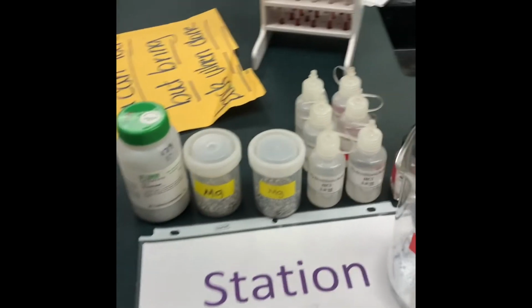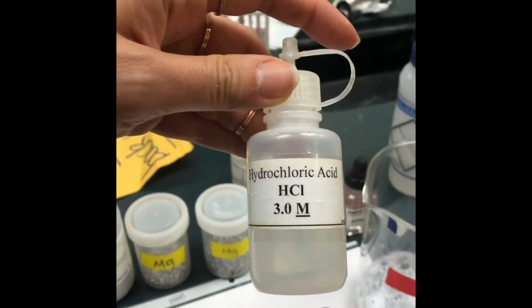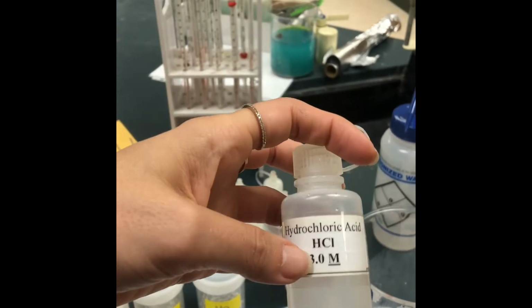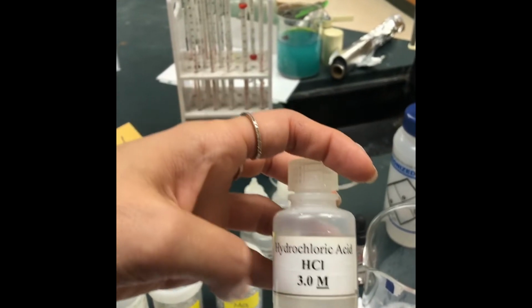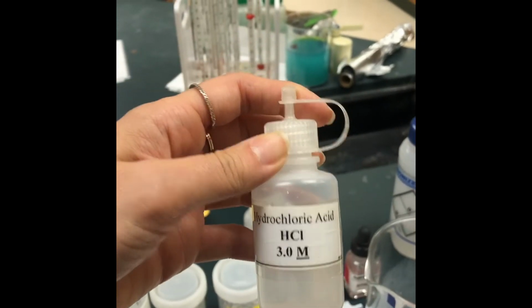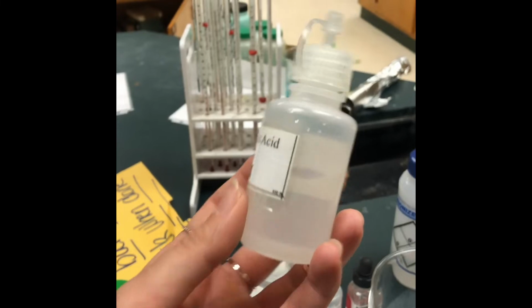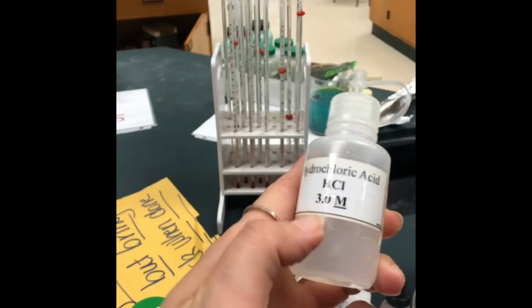Some things I want to mention about station 5 is if we look here at our acids, they are 3.0 M, capital M. Does not stand for meter, it stands for molarity, or we also use molar as an abbreviation. That gives me some information about this acid's concentration. Hydrochloric acid is a strong acid, and 3 molar in the world of molarity is kind of high. We buy hydrochloric acid in a 12 molar concentration, and then I dilute it for you to a 3 molar by adding water to it. So this is acid and water mixed together to make a 3 molar.